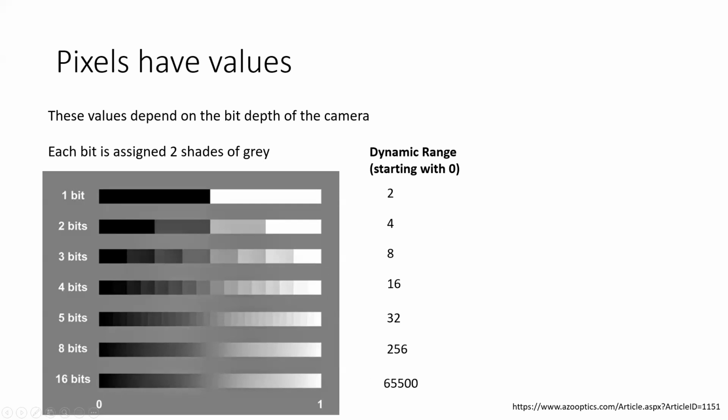Once we keep this in mind, we can start to understand why we need to do analysis. We need to do analysis because our eyes probably cannot see more than 5 bits of grays. Probably if it's 6-bit, you might. But honestly, with 256, I don't know if I can differentiate between every single shade of gray. And that's where quantification of data comes into the picture.